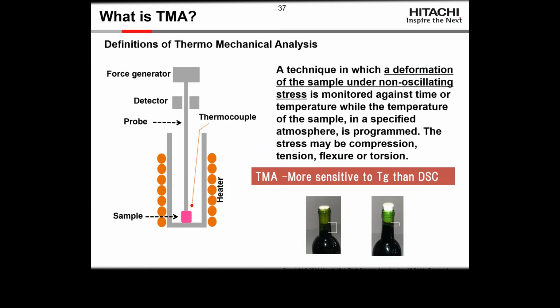So what thermomechanical analysis is basically measuring is the size, with a very accurate micrometer, normally an LVDT, as a material heats up. One interesting effect of this approach is that the TMA is more sensitive to the glass transition than the DSC, so a lot of people will use it for that. But the real important thing is it's good for measuring thermal expansion.